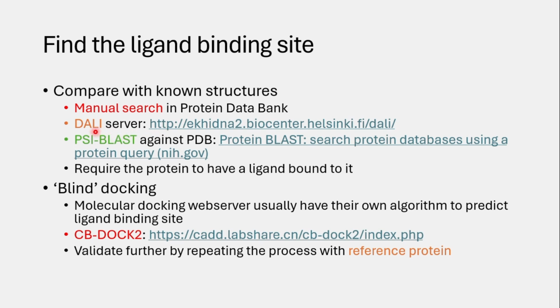methodological about this, we can submit our protein structure to the DALI server. So what DALI server does is that it will perform structure similarity against all the proteins from the protein data bank, and then give us proteins that are most similar to our query protein, which is our protein of interest.